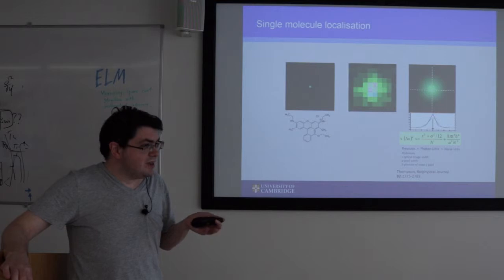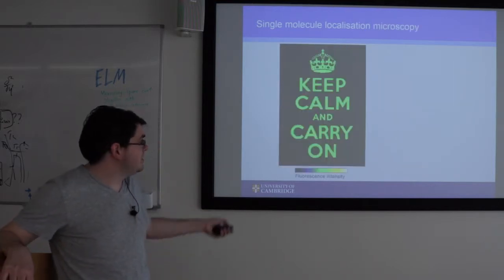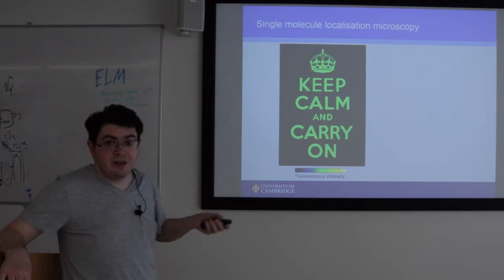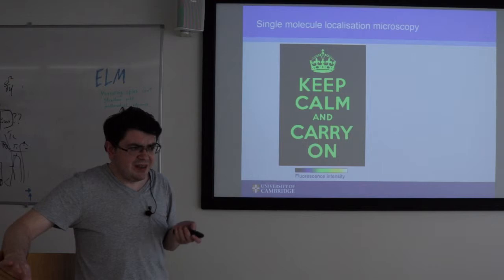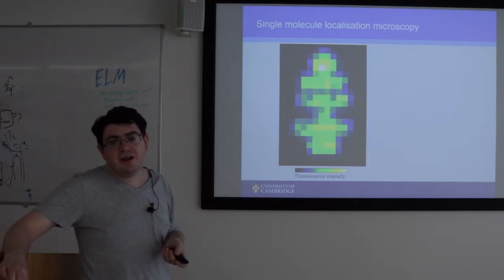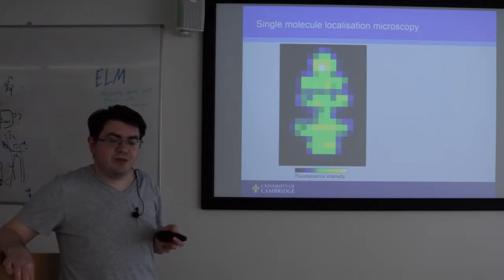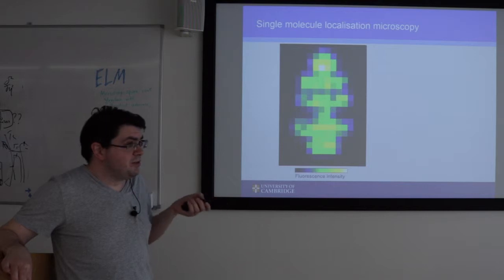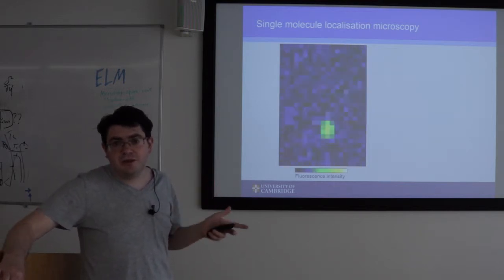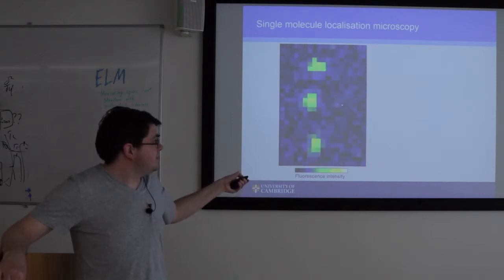And you say, that's not very useful for looking at samples, because imagine I have a sample which looks like this. Imagine I have this important poster, but imagine it's only 2 micrometers wide. In that case, the optical image might be blurred and pixelated like that. So how could we use single molecule localization to read the important message? Well, the answer is if we have a photo-switching fluorescent molecule, we might be able to image a few molecules at a time and collect data like this.